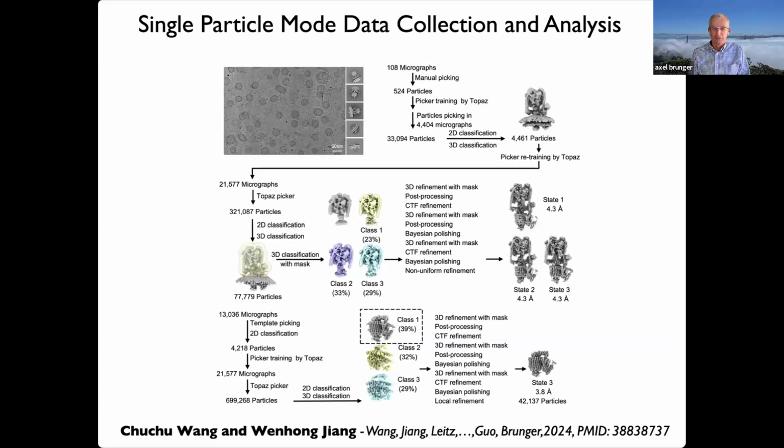How do we deal with the membrane? I think that's clearly from a computational perspective. We have to have better ways of suppressing the membrane signal to improve the resolution in these regions. So we've just started to explore a number of approaches. I know Fred Sigworth developed a method to use a model of bilayers and subtract that from the micrographs, and we're just trying this out actually. So I'll get back to you when we know if that's actually working.